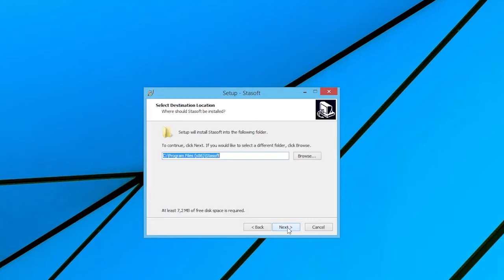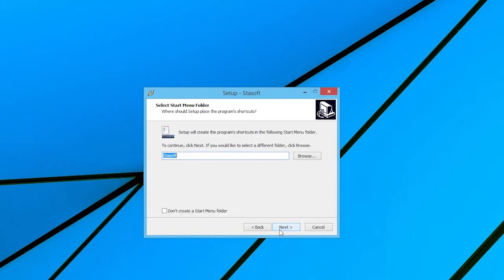Selecting Next, the user has the opportunity of selecting the program's destination from the Select Destination Location window. Continue with the installation by selecting Next, which brings up the Select Start Menu Folder window onto the screen.